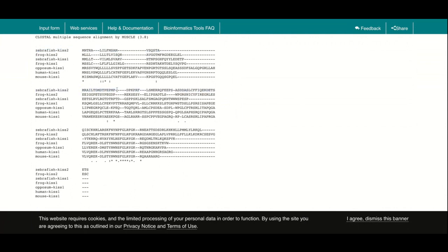And remember the indels, these lines here, the computer put them there so that it could fit these 2 arginines here. In the sequence of that gene, these hyphens here don't exist. So there's a proline there, and there's this aspartic acid there. They're right next to each other. That gap doesn't exist. The gap is introduced for the alignment purposes only.